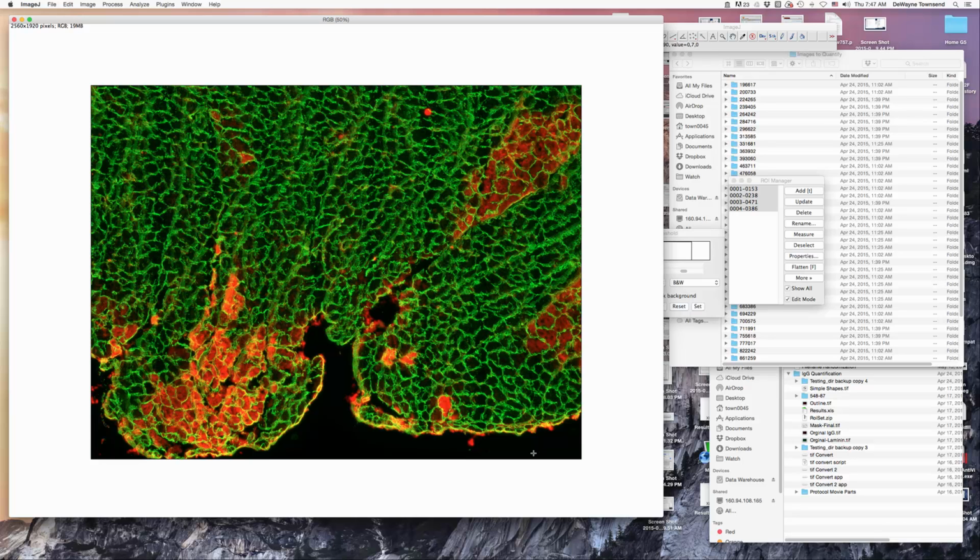Some of these other little dots are probably not myocytes, so there's a bit of a learning curve in deciding what is a myocyte and what is not. But the important aspect is that everything we decide will be recorded, so we'll know we recorded this as a myocyte. If we come back, we can always go through and say, you know what, this probably wasn't a myocyte.